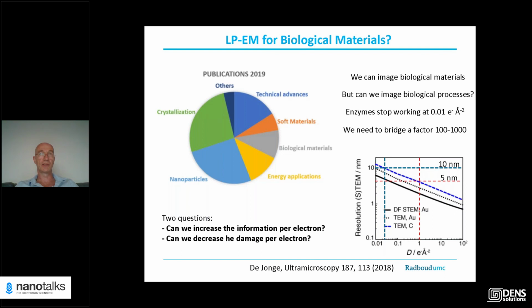If you have a small leak somewhere, then you would like to go to the microscope earlier. But we are now trying to optimize the system such that we can encapsulate a sample and then take our time until we go to the microscope. So at this moment, it's somewhere between, let's say, half an hour and 24 hours.